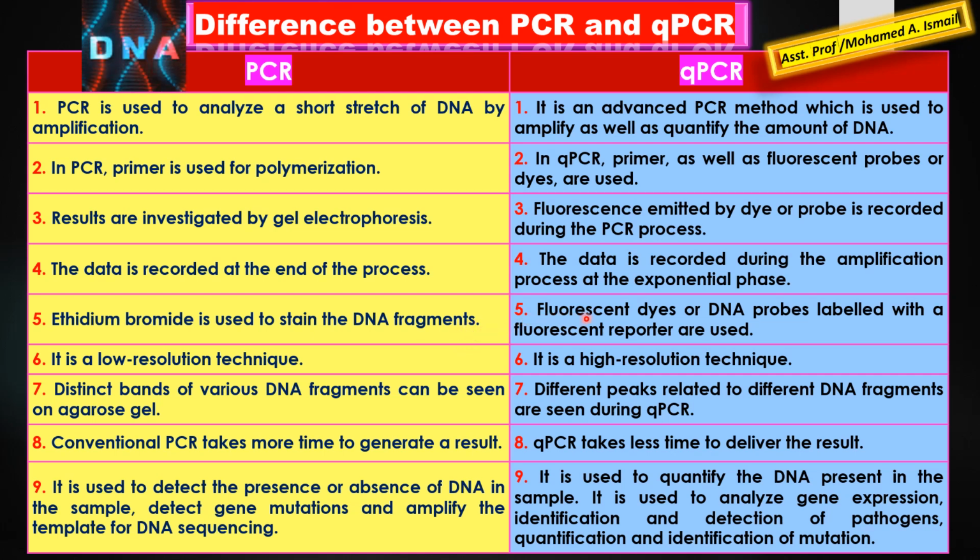Fluorescent dyes or DNA probes labeled with a fluorescent reporter are used. Number six, it is a low resolution technique. 6. It is a high resolution technique.